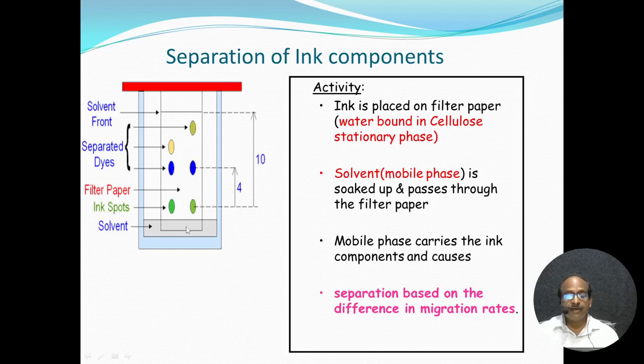On the solvent front side, you are using paper chromatography. Substances with slight differences, or low molecular weight, almost similar molecular weight, we can definitely resolve all the components. How much quantity is present in the particular sample can be determined. That is a great technique, paper chromatography.